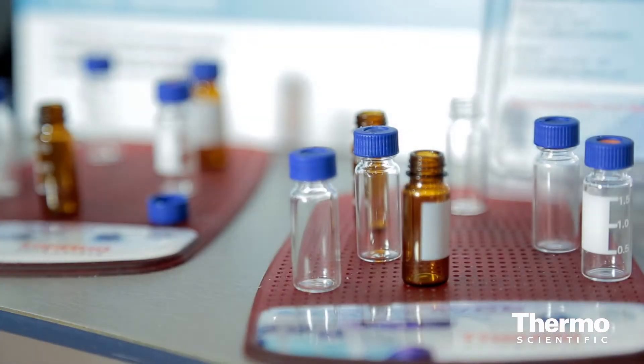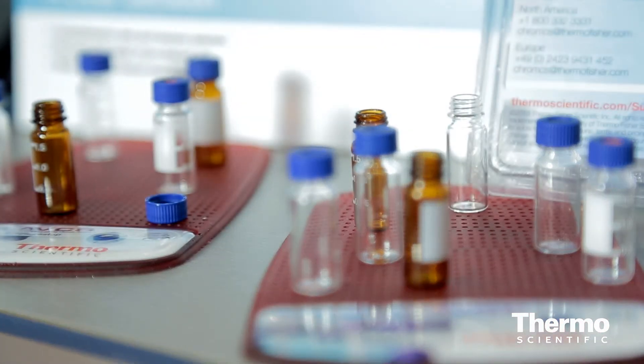First is a nine millimeter screw thread closure that features a SEPTA sealing ring. What that sealing ring does is allow the SEPTA to stay firm in the rim of the cap and actually eliminate the problems that customers have found with SEPTA push through. It also allows customers not to need to use bonded closures, which can sometimes be a little bit more expensive.